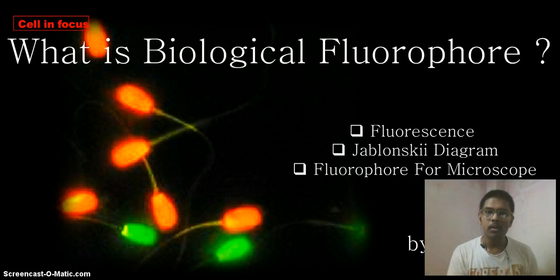So in the electron also the same thing happens. Whenever there is no excitation, the stable state of the electron is the ground state, meaning no energy. And then whenever you give some energy, the electron takes energy. Now it is excited, it goes to the first floor, second floor, third floor, whatever the excitation.